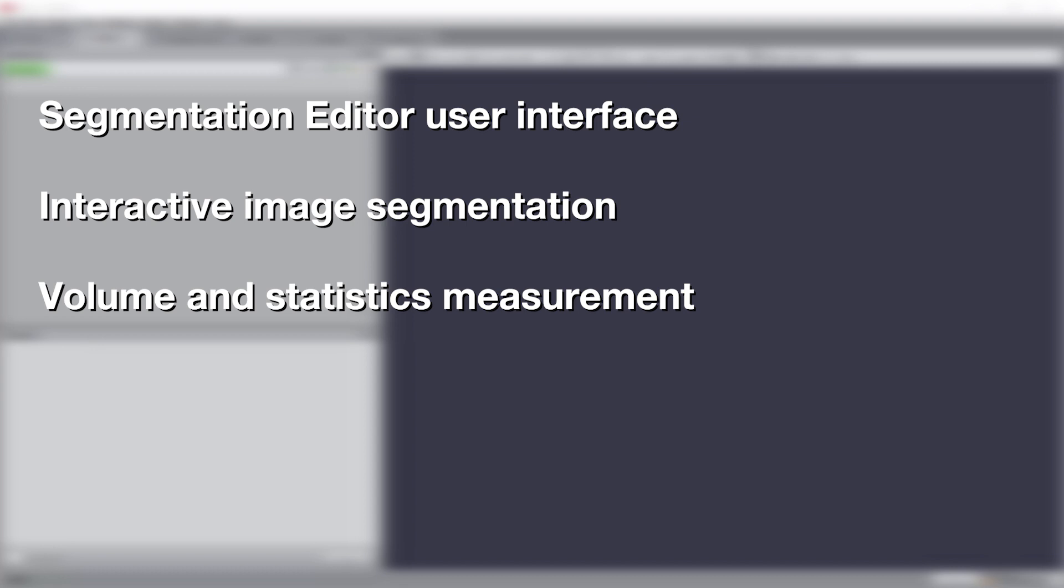Please note that this tutorial provides only an example of usage of the segmentation editor using only features from the basic software package. More advanced features or usages of the segmentation editor are presented in other video tutorials or in the user's guide.